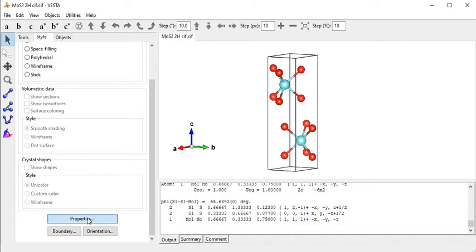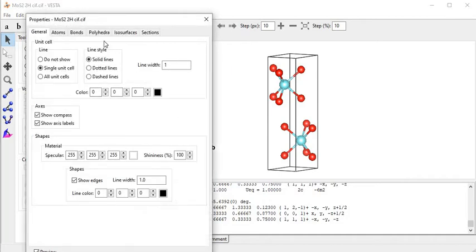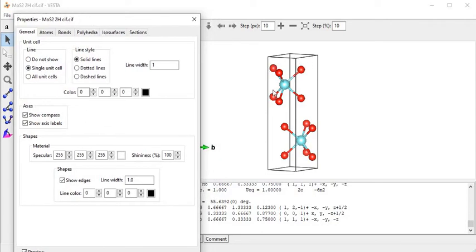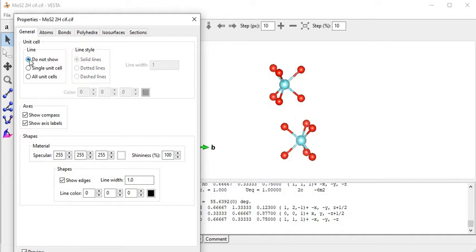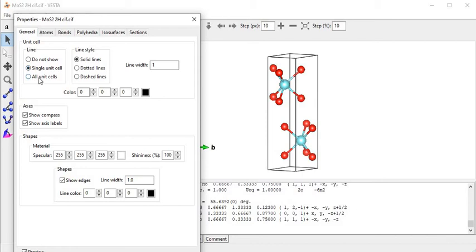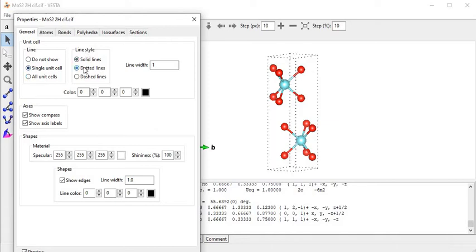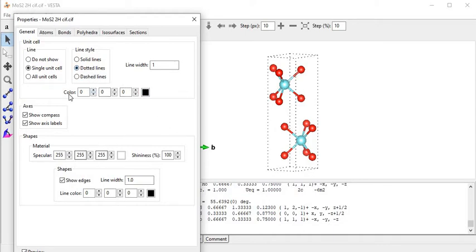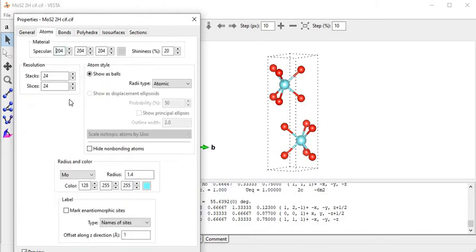Now I come to the bottom part: Properties. This is a very important part. Here we can change the unit cell display - if we don't want to show the unit cell, just uncheck that option. If I increase the supercell along the x or y direction and want to show all units, I click on that part. The line style options include dotted and dashed lines.